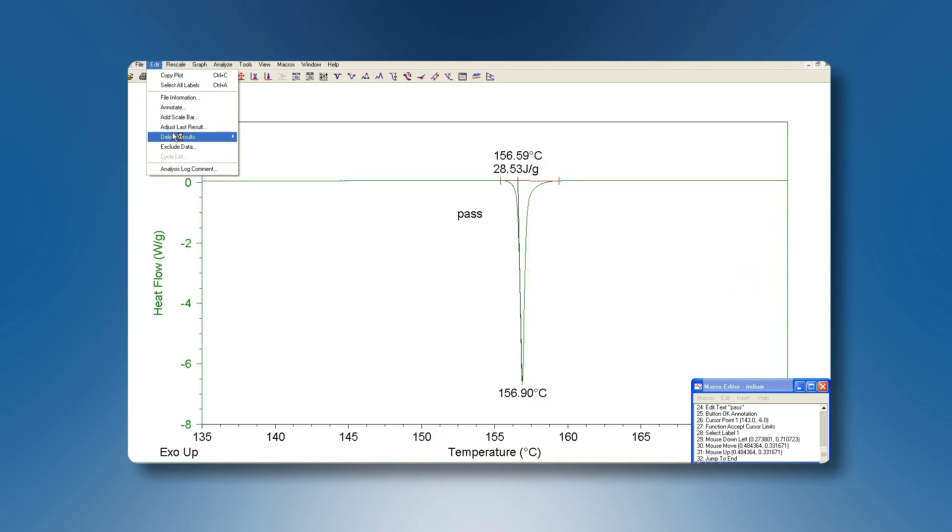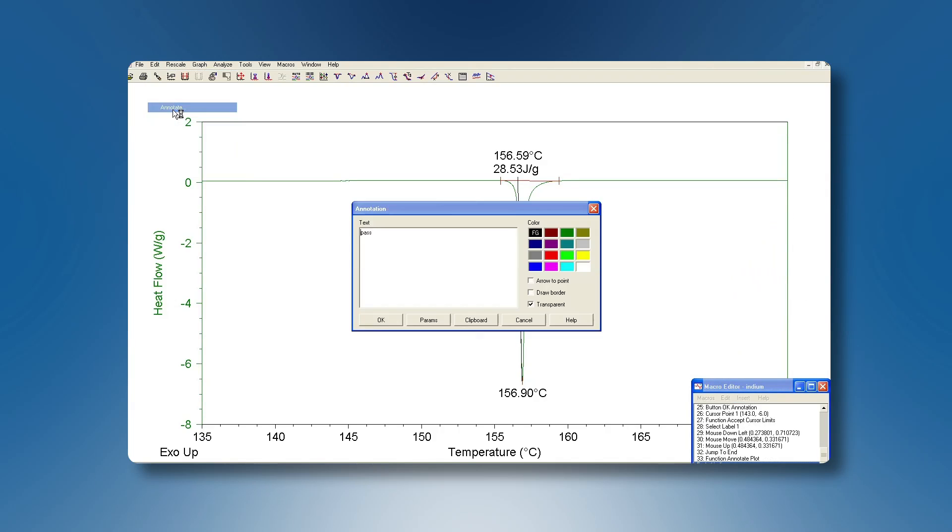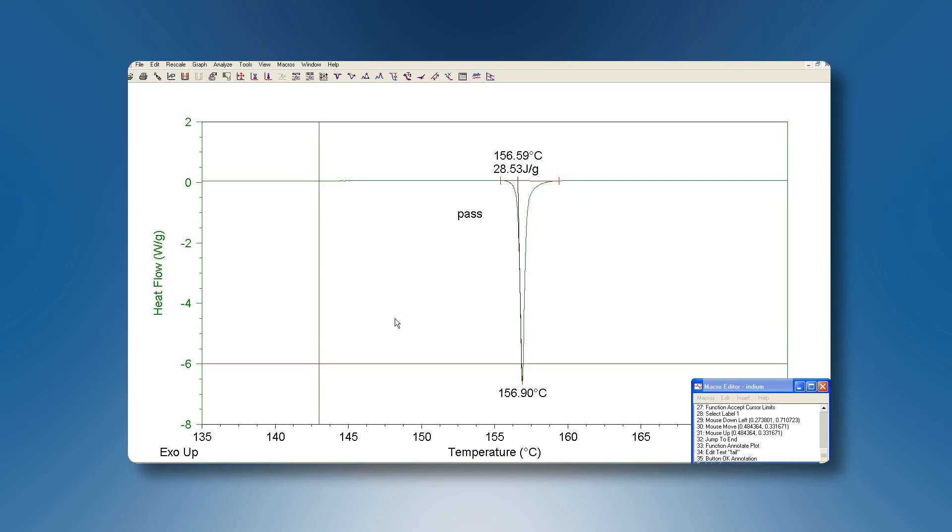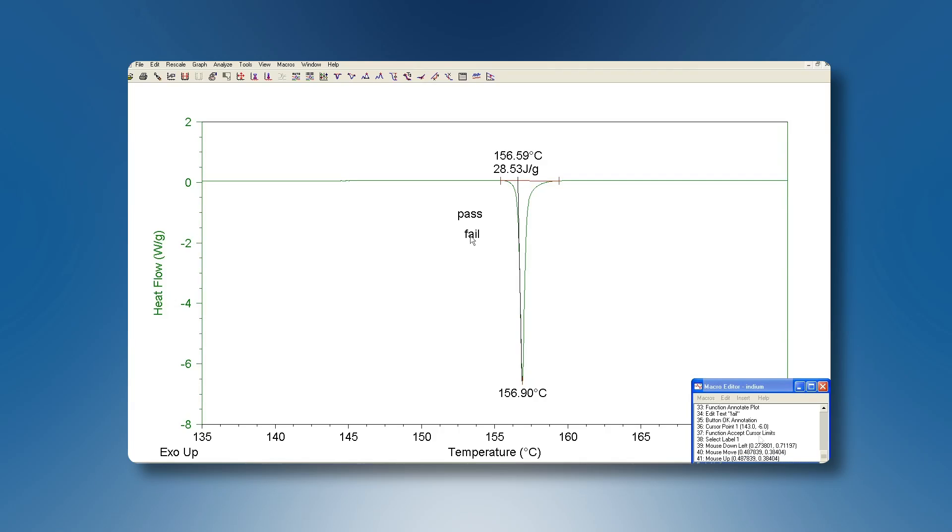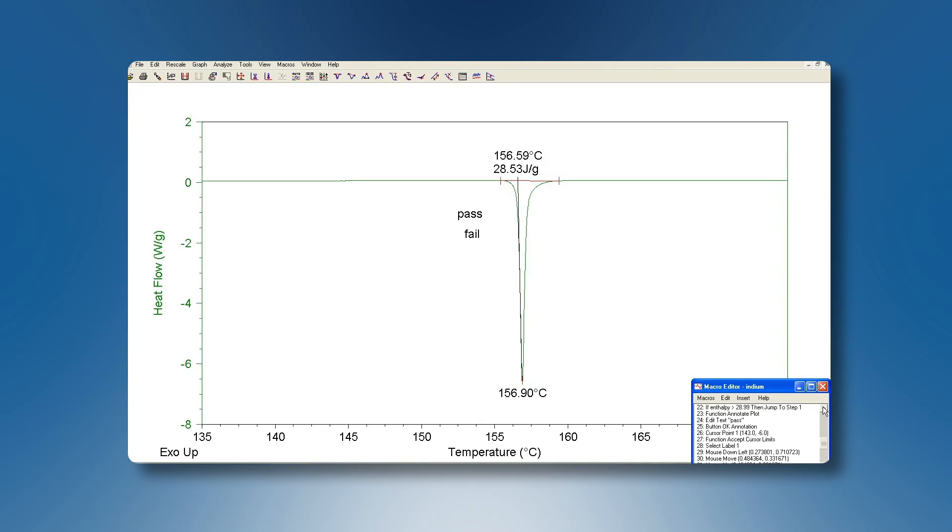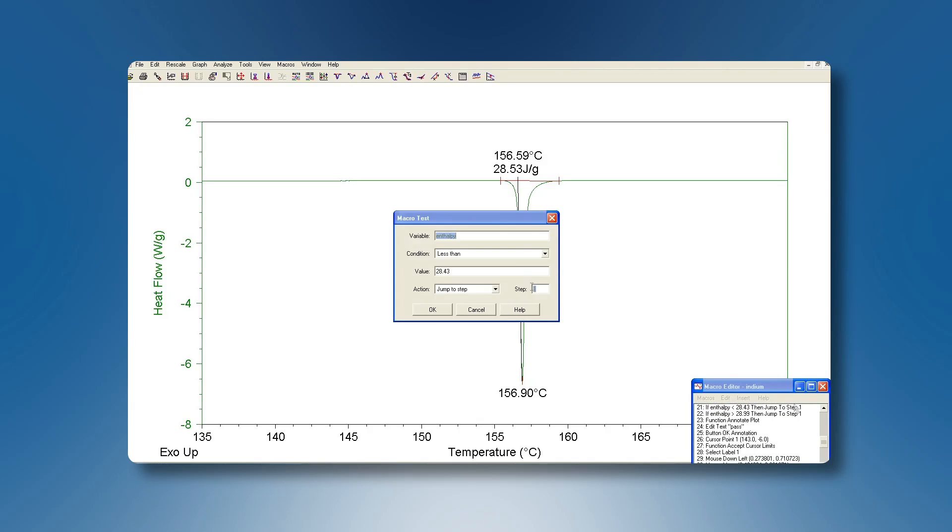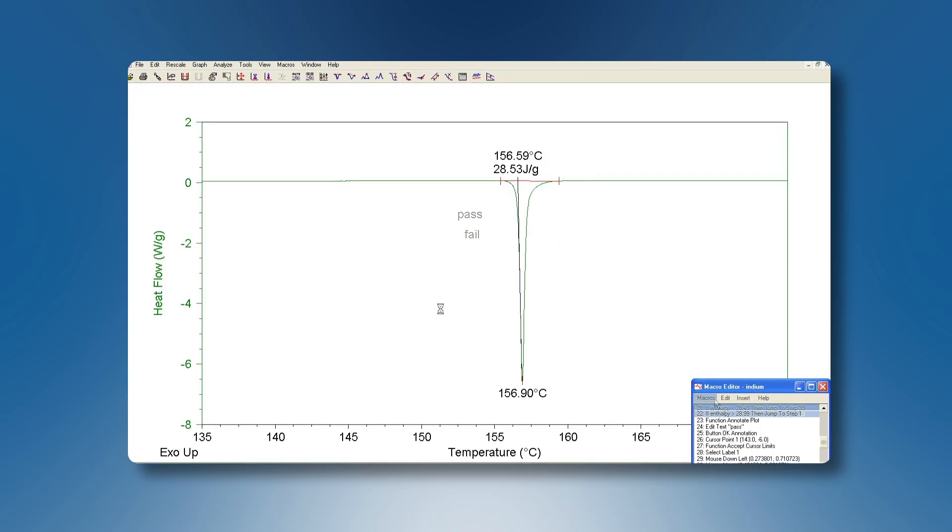Finally we need to define what happens in case of a fail. For that purpose we create a fail annotation. Do not worry at this moment that both pass and fail messages appear on the same plot. Setting up this annotation for the case of failing starts at step 33. We still need to redirect the earlier two jump commands to this step by clicking on them and typing the correct step.